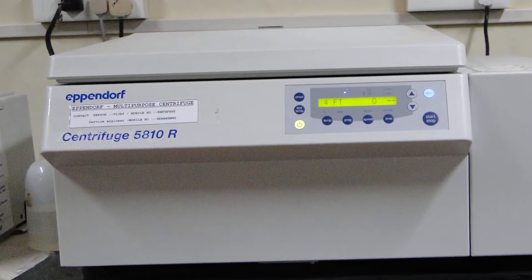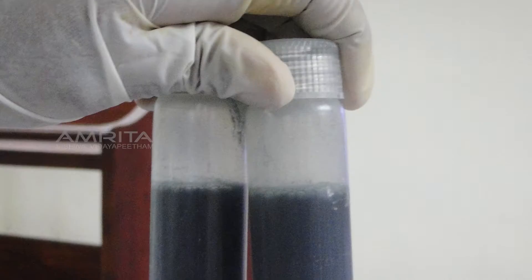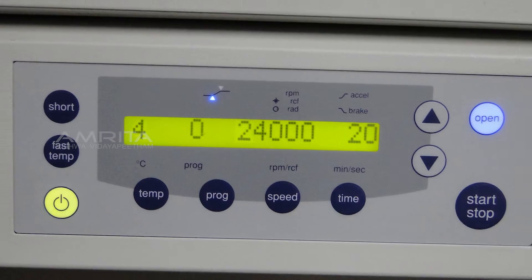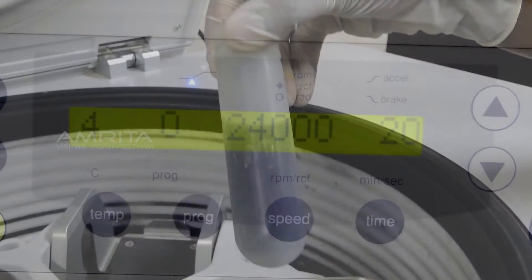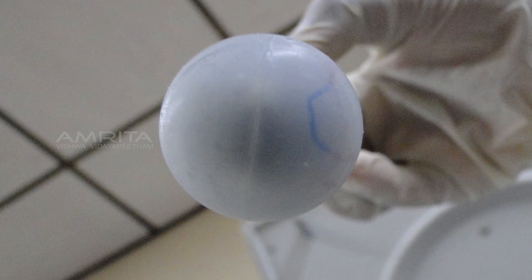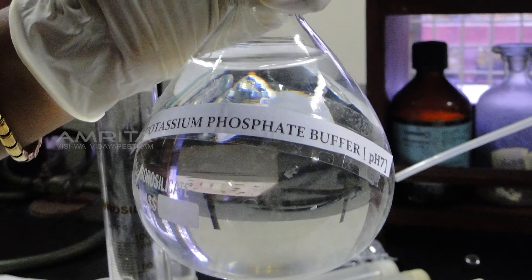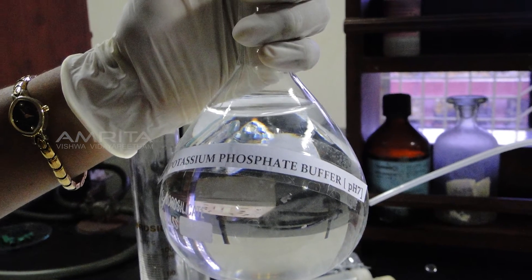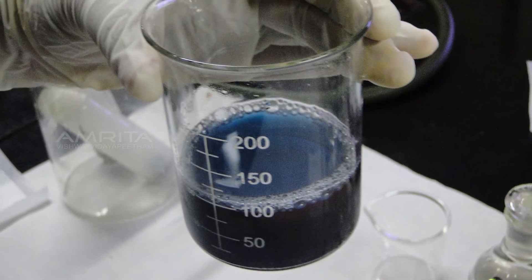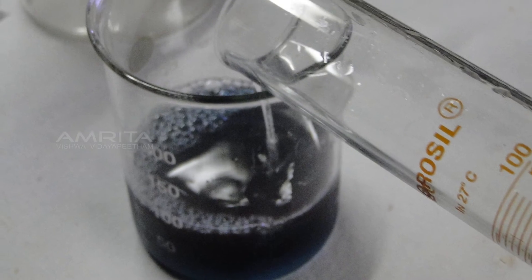The solution is then centrifuged to remove the cell debris. Transfer the solution into centrifuge tubes. Centrifugation is done for 20 minutes at 24,000 rpm at 4°C. After 20 minutes, take out the tubes from the centrifuge — you will notice blue pellets in each tube. The supernatant is transferred into a 250ml beaker.